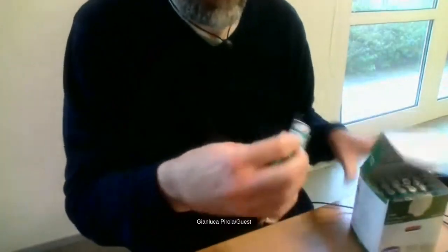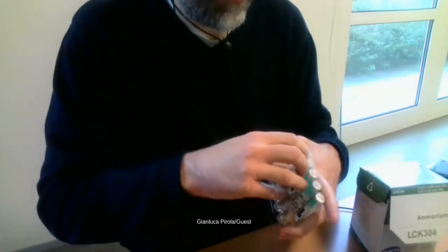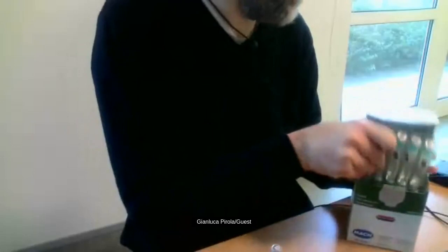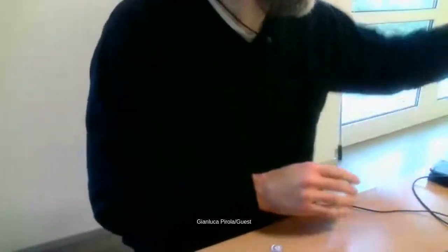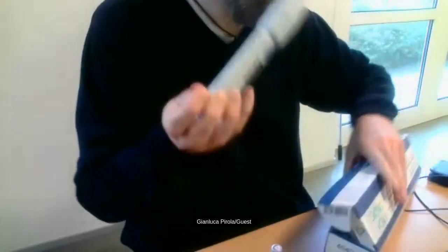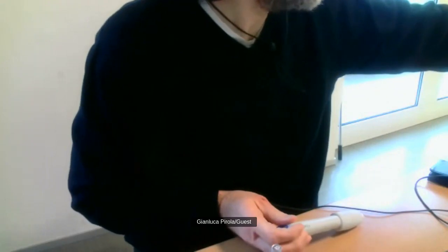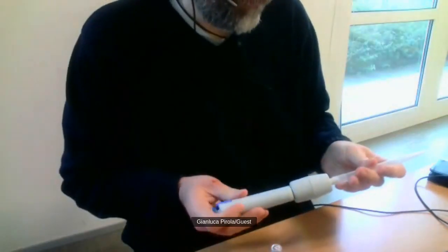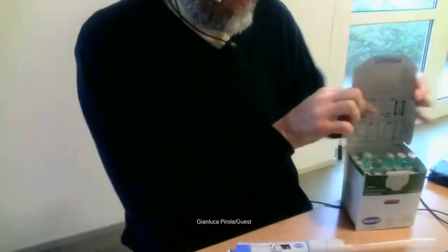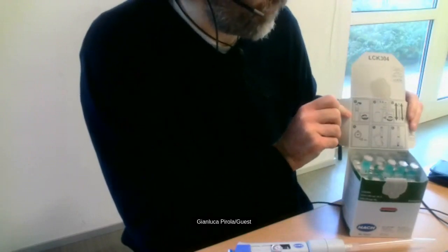This is our cuvette test. We'll put one of the cuvette tests. Well, we have here the pipette and the tips. We can see here, but also as I showed you before, the procedure.